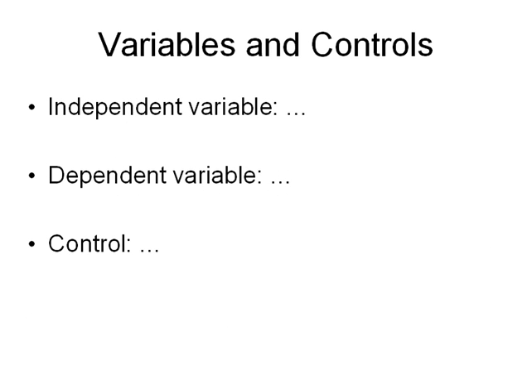Your variables and control. We're still on the right page here underneath your procedure. So the independent variable, I want you to fill this out. All I'm going to remind you is an independent variable is what you changed during the experiment. So think about what thing is changed from one tube to the next.